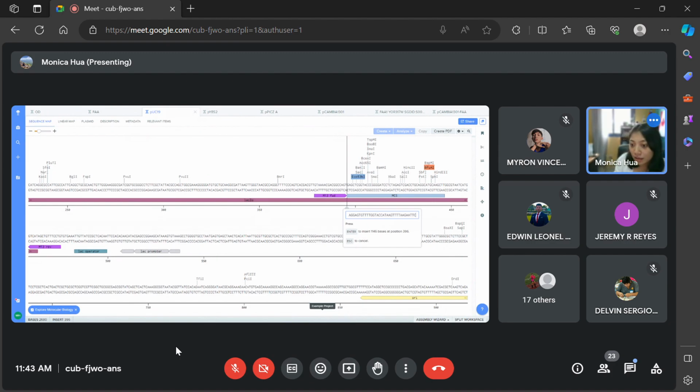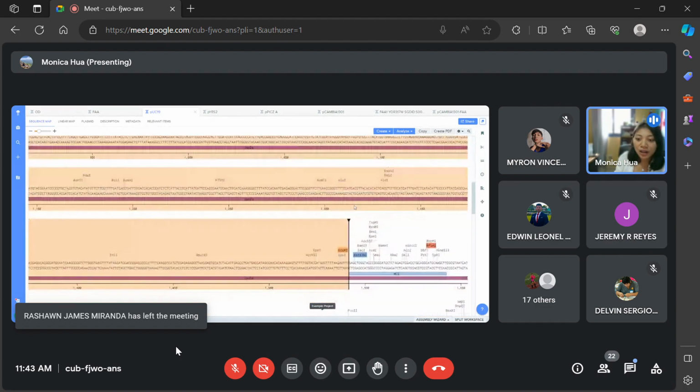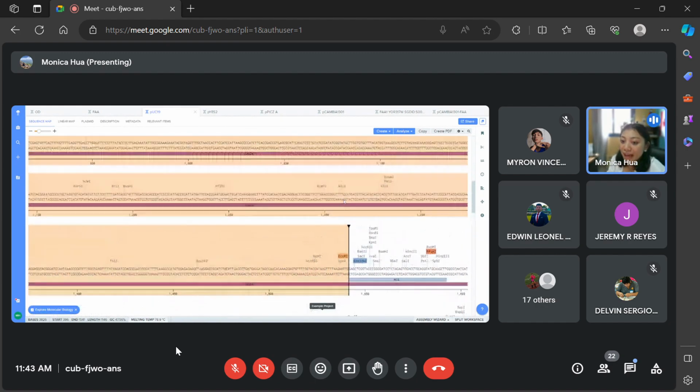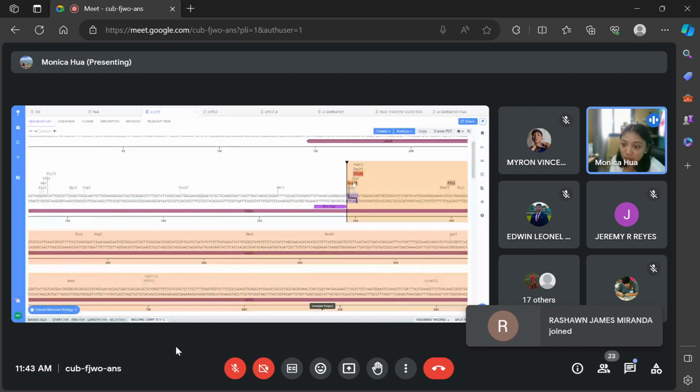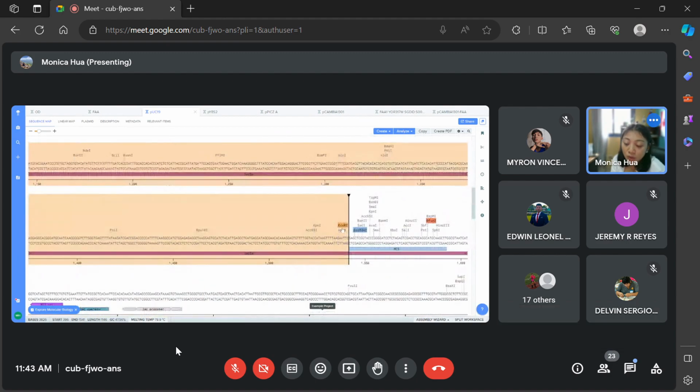Paste all of these bases, enter. There you go. So now you enter the sequence, right? And what you will find is that you will have EcoR1, well, for me, EcoR1 is at the beginning, right? And at the ending, okay?